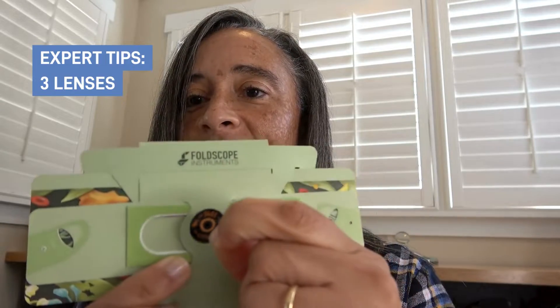Same thing with the 340. I take the 340 and I can just put that right on there, and then I'm ready for viewing.